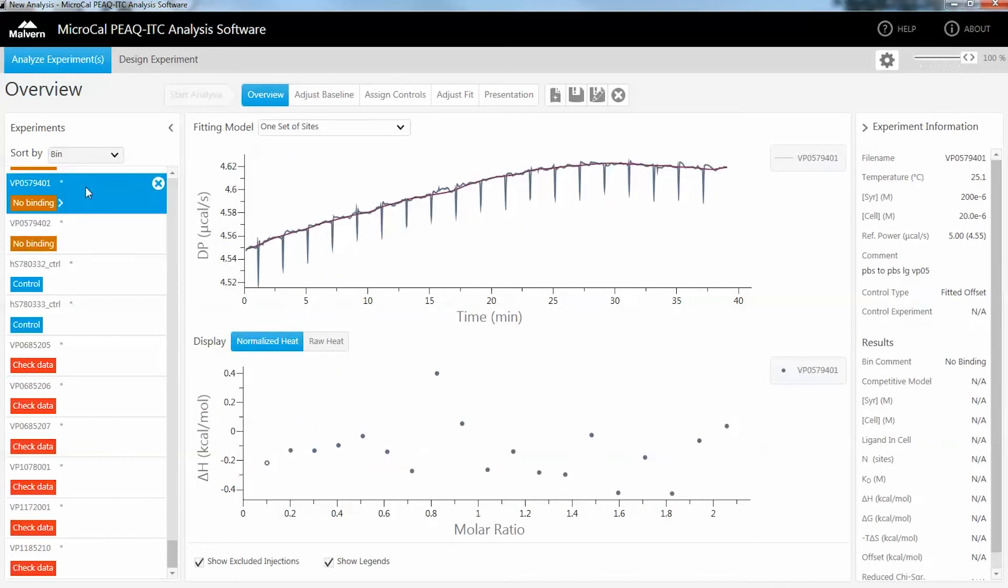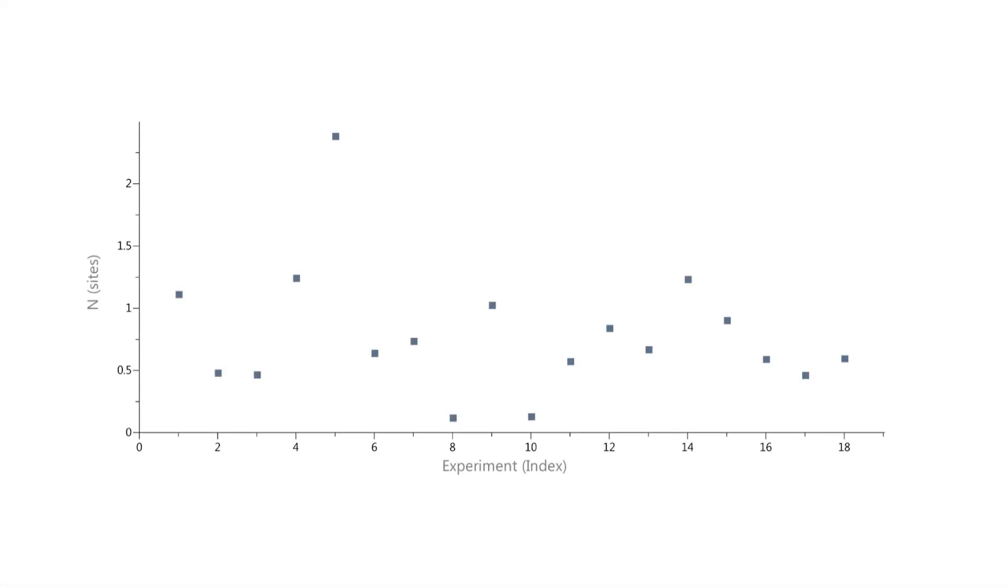From here, for example, we can look for trends in stoichiometry. Binding stoichiometry can reflect decreasing protein homogeneity or activity, or inaccuracies in compound concentrations. The MicroCal PEAQ ITC analysis software facilitates the analysis of binding interactions that are complicated by the presence of inactive protein material, incorrect protein concentrations, and or incorrect concentration or heterogeneity of compound solutions. Here we can normalize for ligand concentration and make your lead optimization studies more robust. Normalizing for protein or compound concentration or accounting for a population of inactive protein can lead to better decision-making processes, one example being a more careful assessment of changes in enthalpic contribution to binding, which are critical to many best-in-class drug studies.